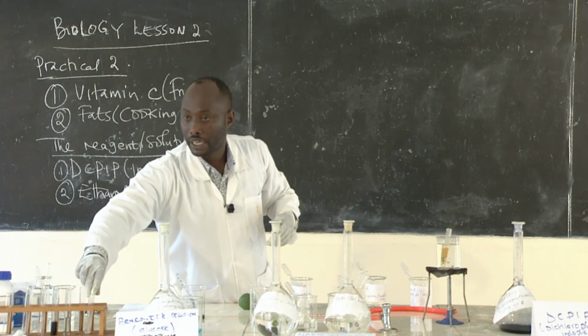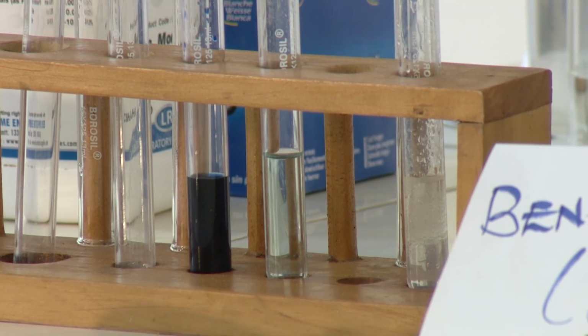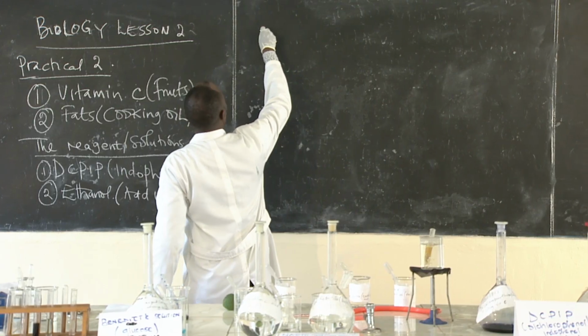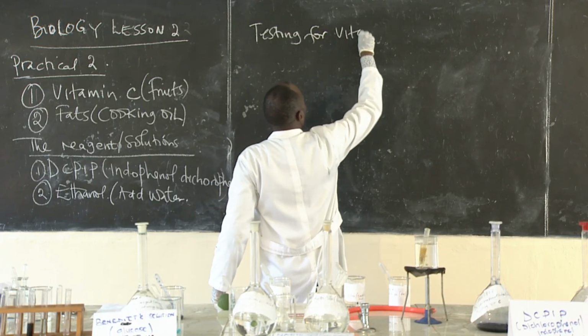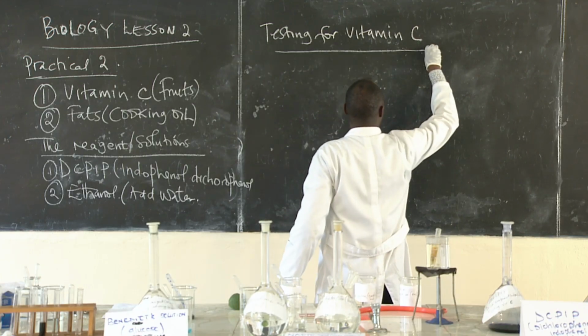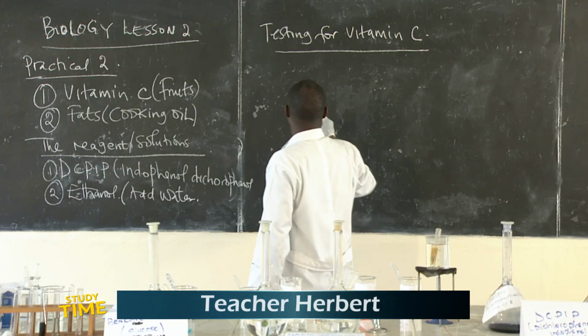So let us take a note. Testing for vitamin C. What do you use to test vitamin C?